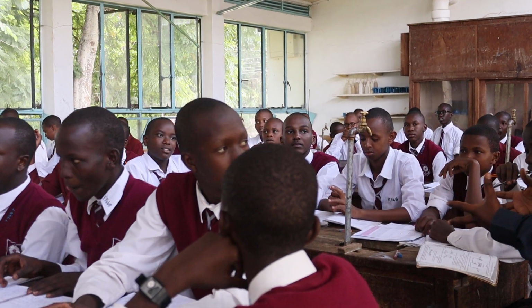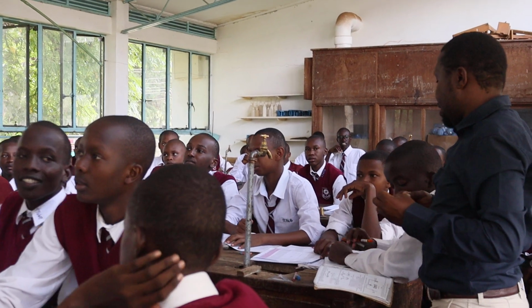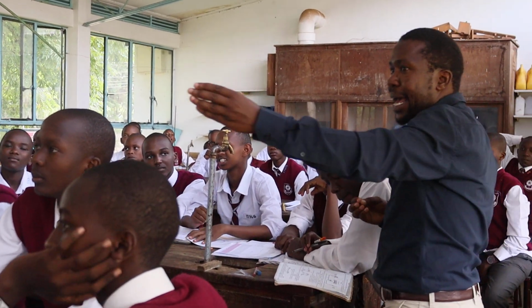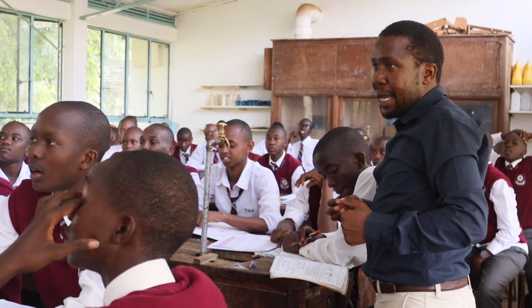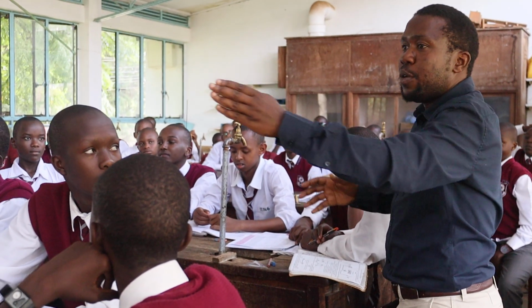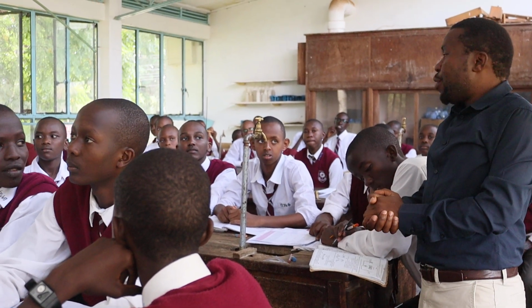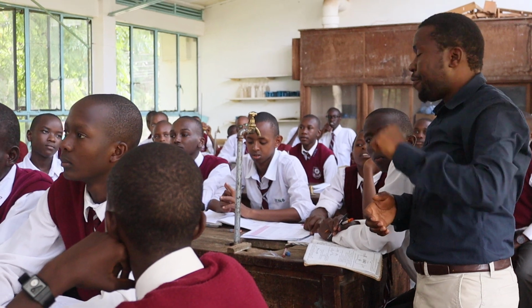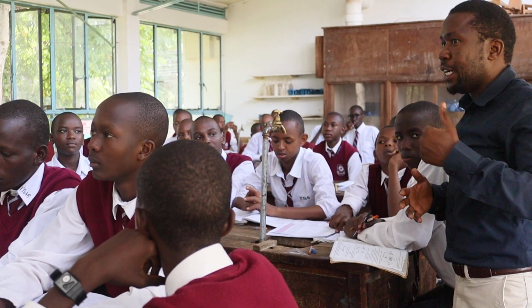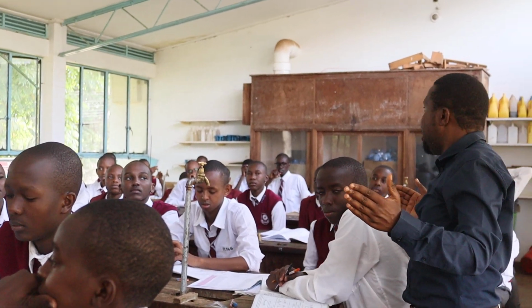Why luminous? Remember, luminous means what? Light. And it produces light because it's yellow in color. Now, if it was in a dark room, this one would give a lot of light because that flame is light. Now, we move to the next flame. I'm going to switch off that flame, then we look at the next flame. Look at the features. Before we proceed, does anyone have a question?